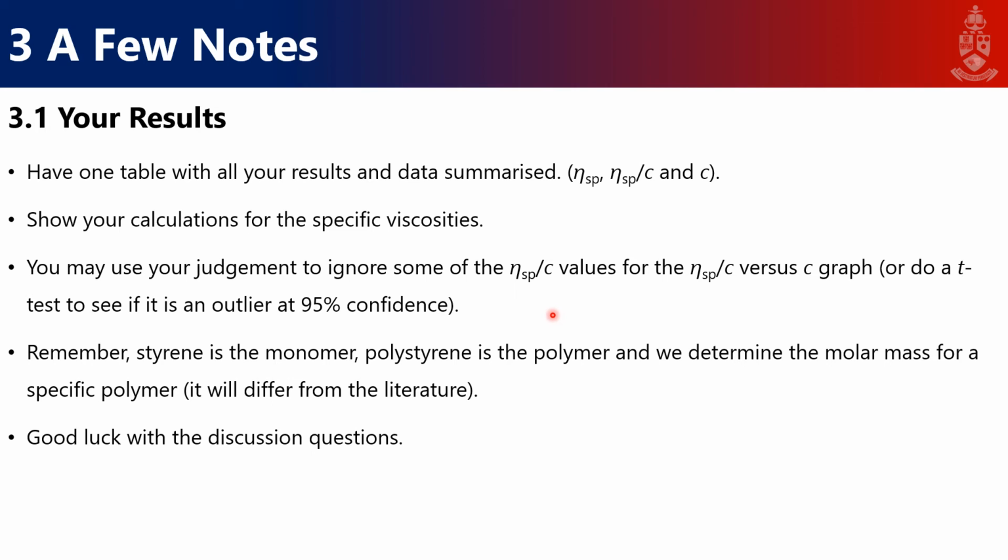There's a very short thing on the theory, but viscosity is actually a very difficult concept, and it's very difficult to measure experimentally, and most of it's based on assumptions, and there's actually no set theory for viscosity. So that's also why this experiment is very easy, because we can't go into too much depth because it gets very sticky, pardon the pun, it gets very sticky the higher the viscosity goes.